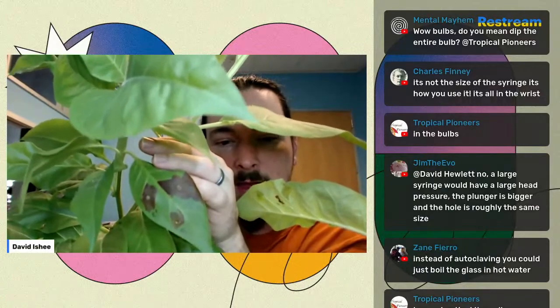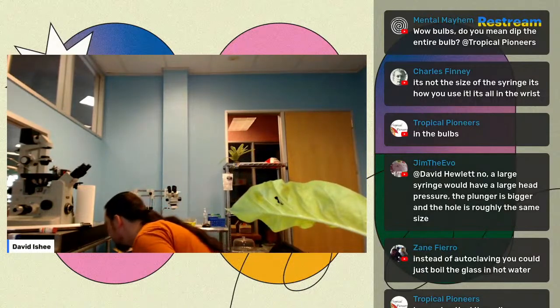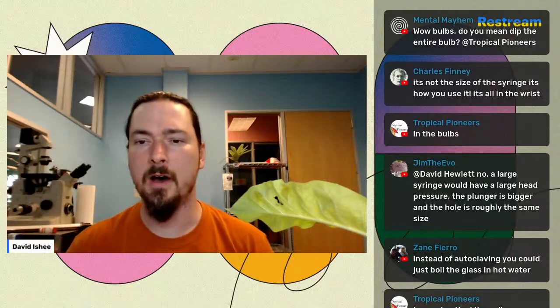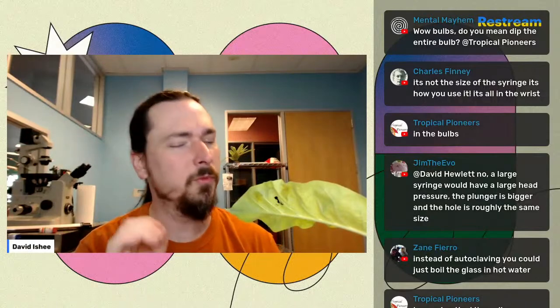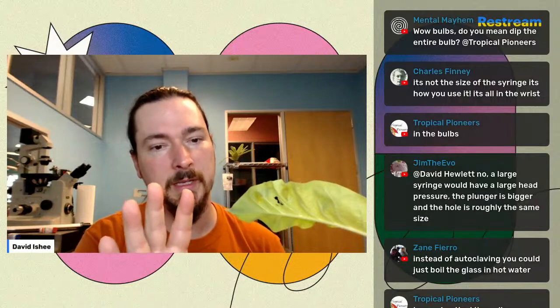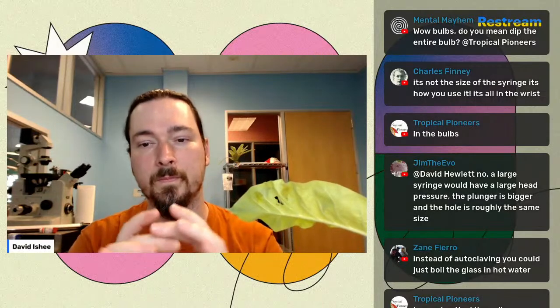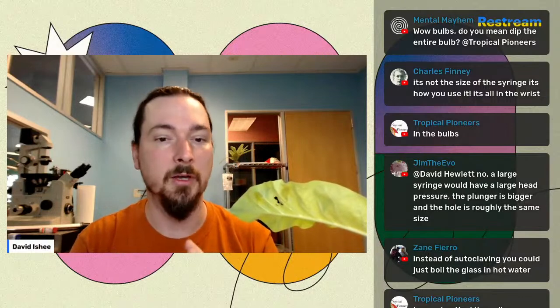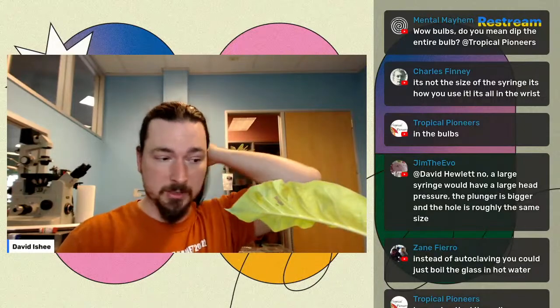All right, so the pressure of the syringe itself is also harmful. So often those circles end up dying. Now you can do it if you're really good, and I've done a lot of practice. So if you're really good, you can just push a little bit into it very gently, and you'll get a relatively small section, but you'll also get a reasonably low pressure, and you won't get any damage to the leaf itself. But that just takes a lot of practice. So just practice and practice.